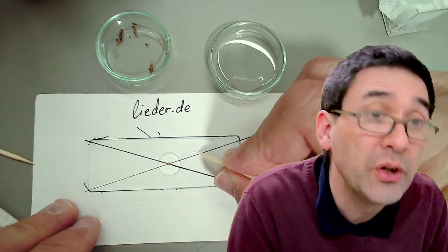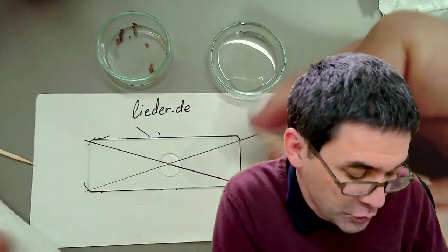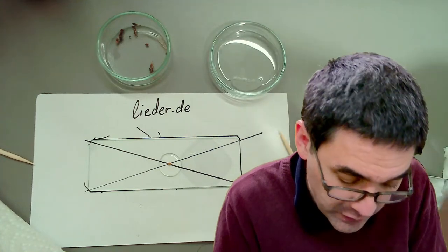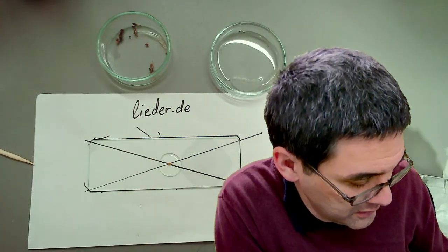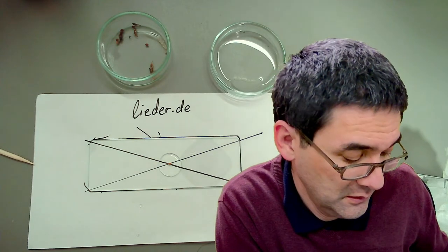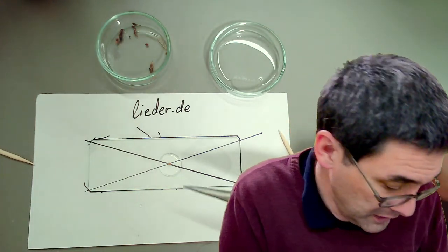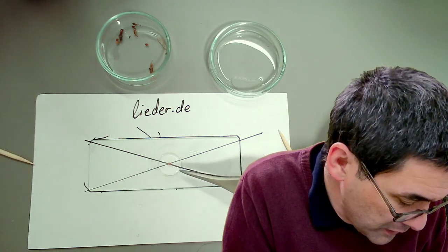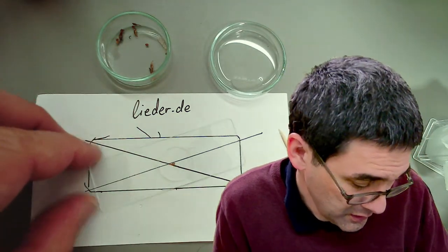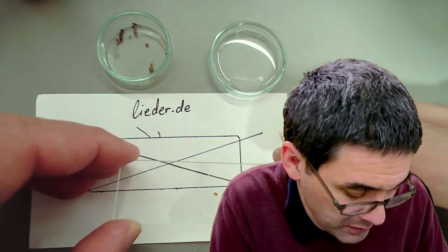Do you actually see this? I have some glue here on the side as well. Usually what I recommend is don't remove it, okay? Just let it dry and then use a sharp knife or so to scratch it off. And last but not least, we have, of course, a cover glass. And here we go. And again, I will put the cover glass on top. Again, over YouTube, over the live stream, seeing these things might not be so easy because everything's so transparent. So let's have a look if this one over here somehow works better concerning bubble formation or not.